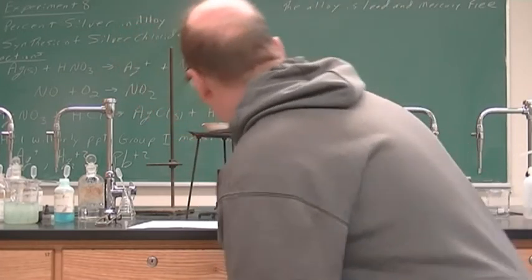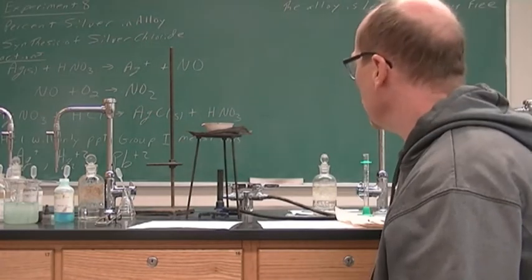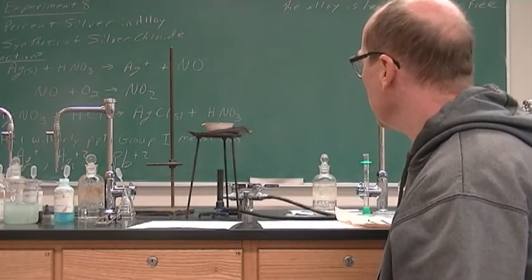Still making some noise, generating some steam, so we're going to give it a few more minutes.